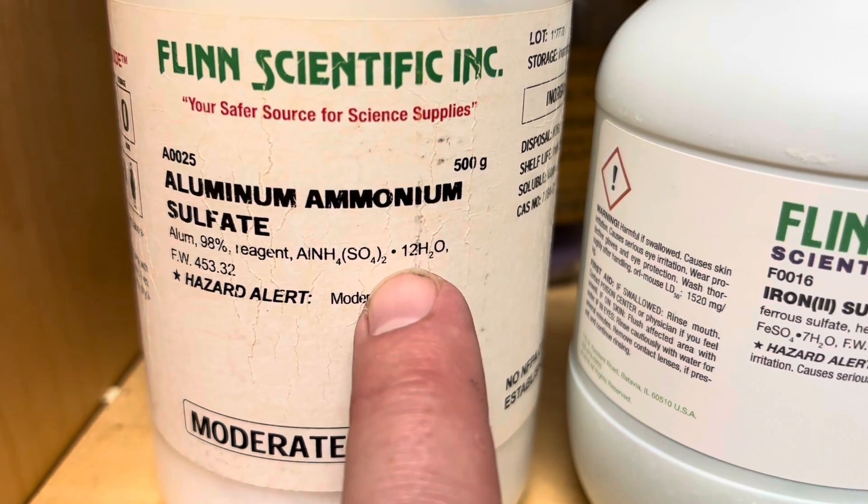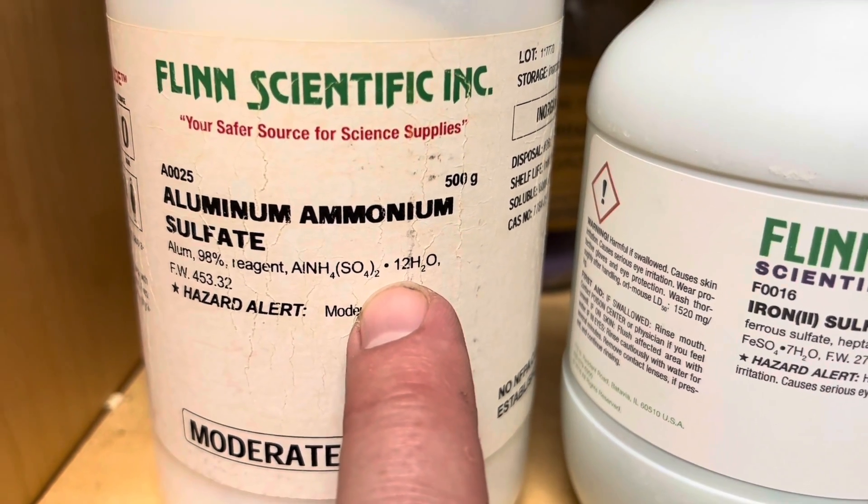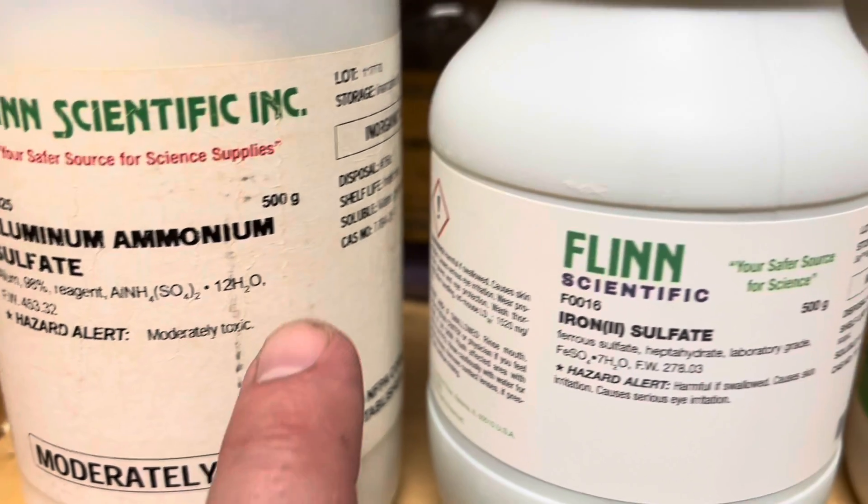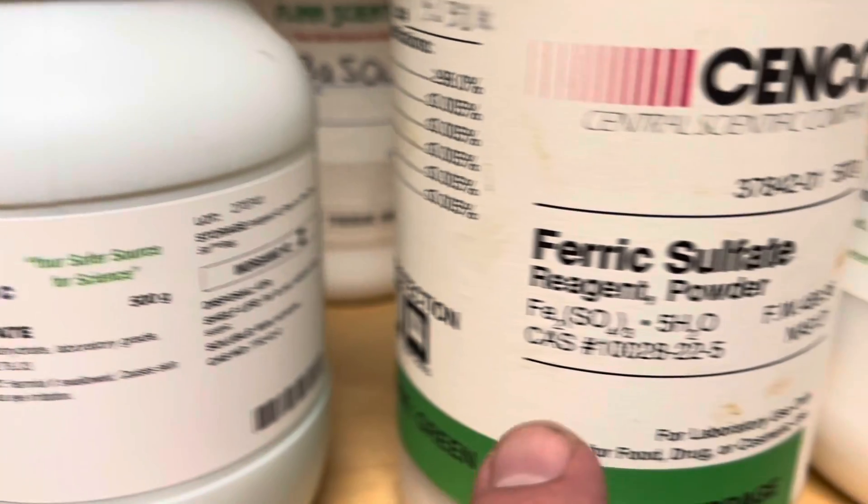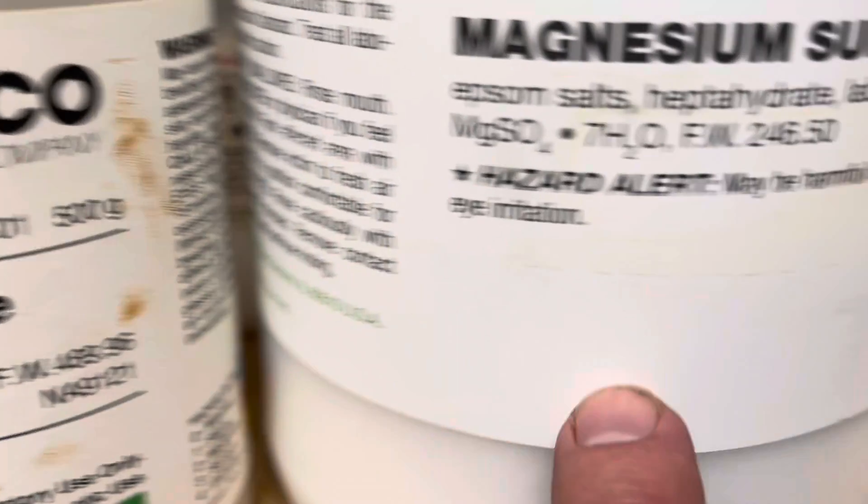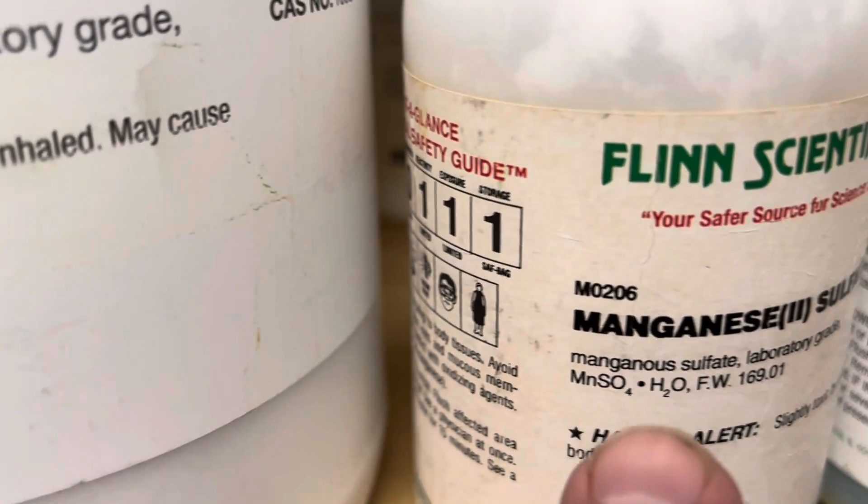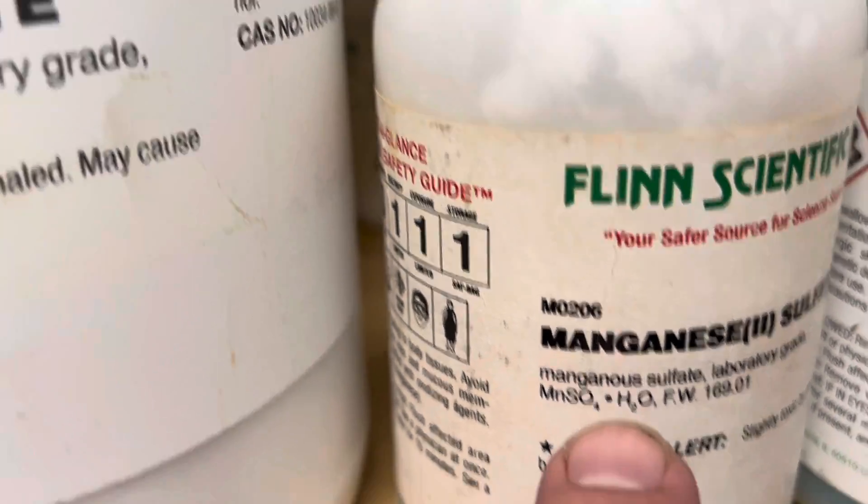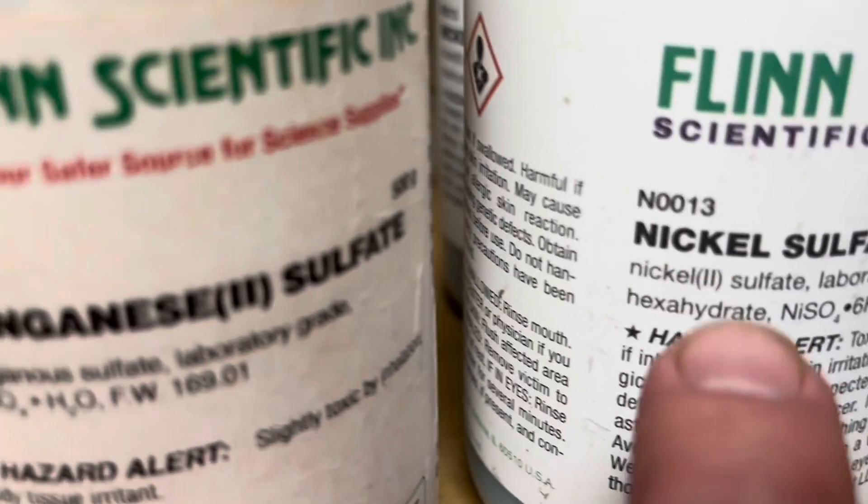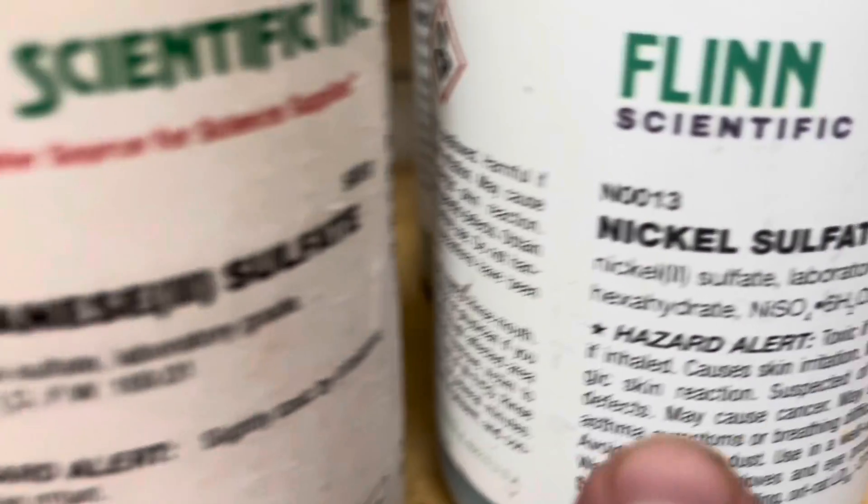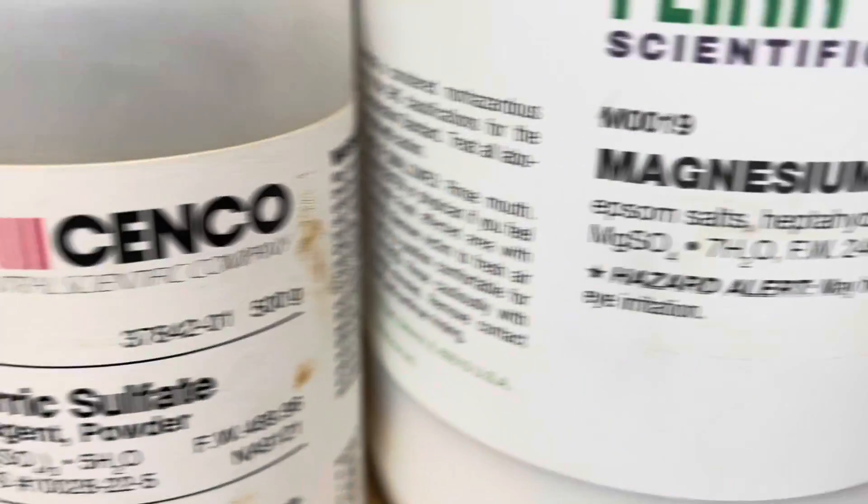Here are several sulfate compounds that are also hydrates. This one is aluminum ammonium sulfate with 12 waters of hydration. They're not always that big. This one only has seven. Ferric sulfate has five. Over here we have manganese sulfate with just one water of hydration, and nickel sulfate with six. So it turns out a lot of sulfates are hydrated compounds.